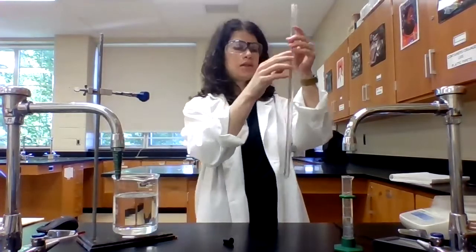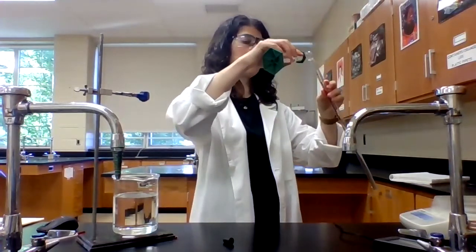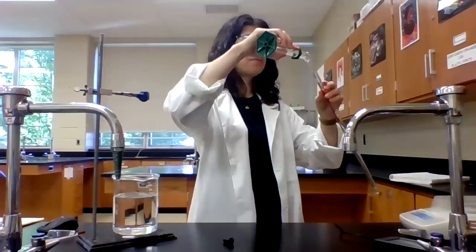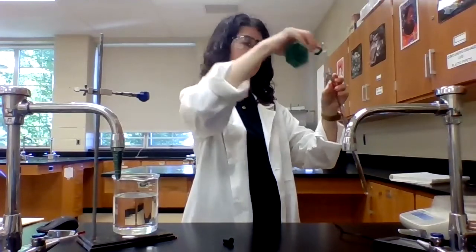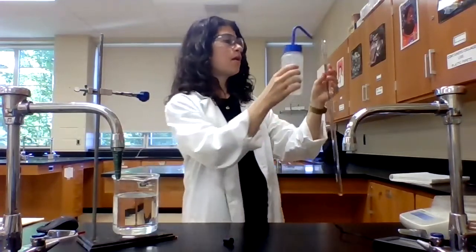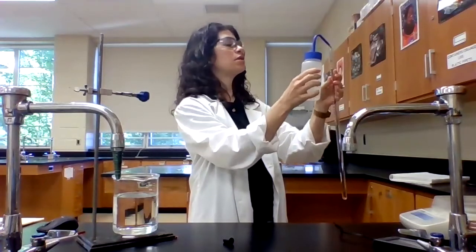Okay, so what I want to do now is add the hydrochloric acid to the eudiometer. I'm just going to pour that in. The hydrochloric acid is going to stay at the bottom of the eudiometer. I'm then going to fill the rest of the eudiometer up with deionized water. Hydrochloric acid is more dense than water, so the hydrochloric acid is going to stay at the bottom and the water is going to stay on top.